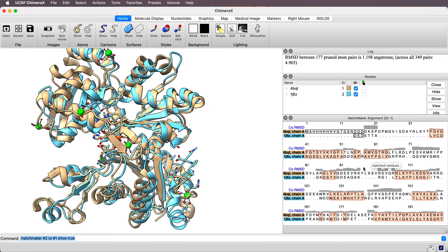When it made this, it assigned an attribute to each residue saying what this C-alpha RMSD value is. And we're going to use that to color.